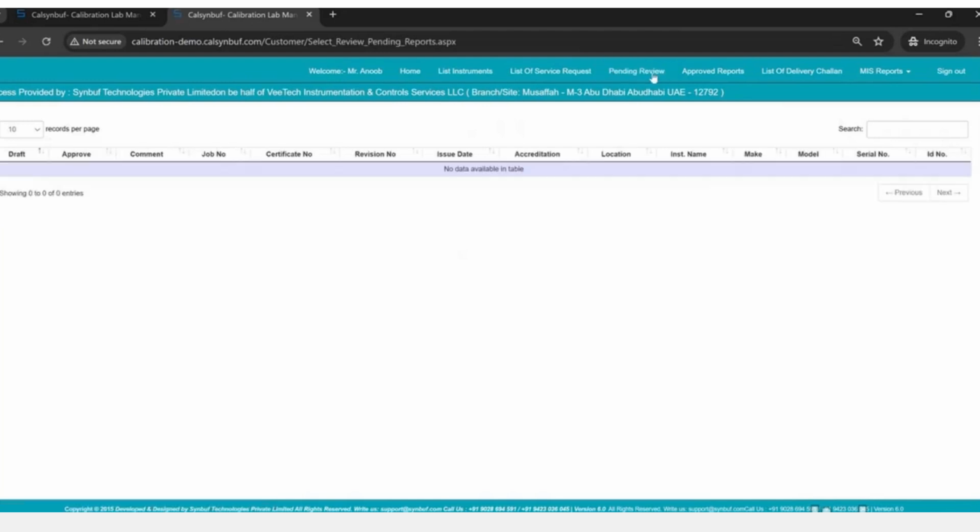This is pending review. If you send some instrument for review, then that list will be here. He is able to approve and able to comment. If he comments something, then that comment will be visible to your calibration engineer. What is the meaning of a comment? It is the comment done by the customer on that report.